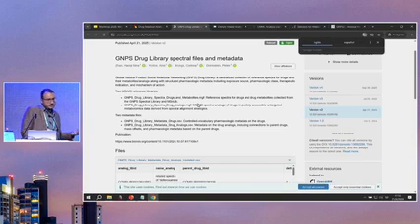If for any reason you want to work with just one of those and not use the app, you can download the library here, and then select this library on your GNPS job and work directly with one of those libraries.